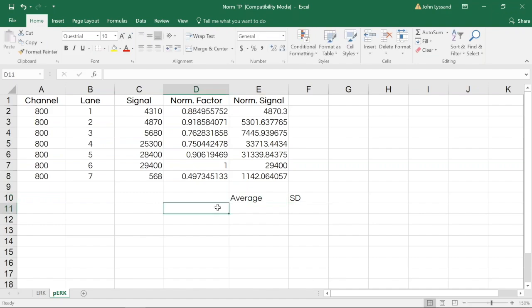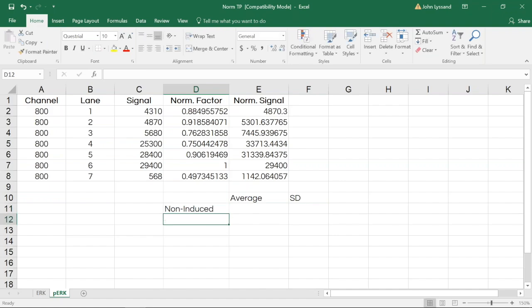Lanes 1 through 3 were derived from non-induced cell lines, and lanes 4 through 6 from induced.